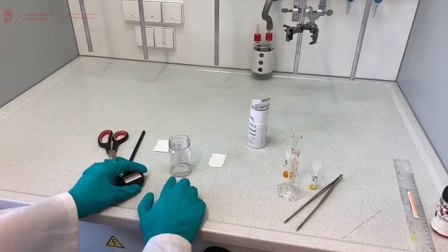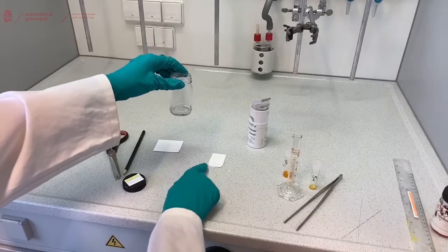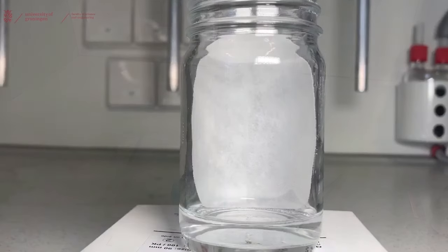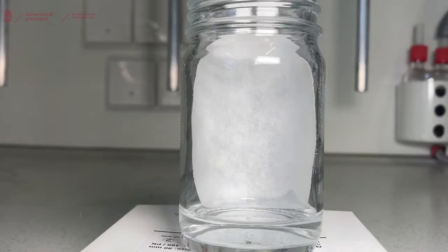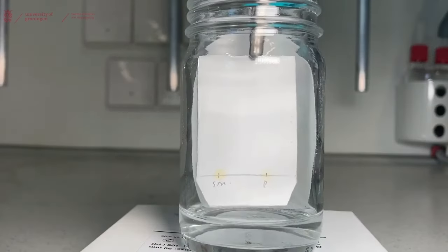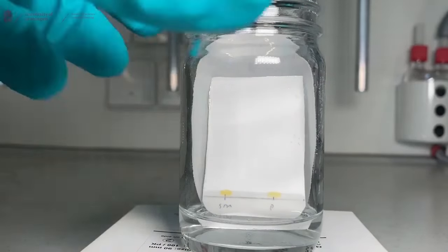Make sure that the liquid level of your TLC jar is lower than the baseline you draw on your TLC plate. Place the TLC inside of the jar. It's useful when you're doing this to use tweezers, because your fingers often don't fit into the jar. Carefully place it down leaning against the filter paper and close the jar.